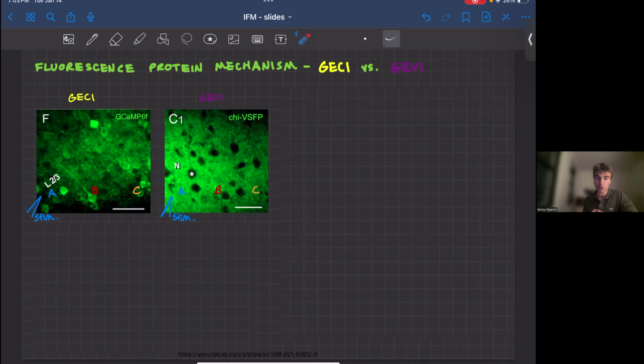In this figure here, we show these two different fluorescent indicators. Calcium indicators are located within the cell, while voltage indicators are located on the membrane of the cell. The result is that a picture in voltage looks like a negative of those cells. Another thing to note is that due to the limited space of the membrane compared to the entire volume within the cell, there is a restricted number of voltage indicators one can place before altering the biological and physical properties of the cells.